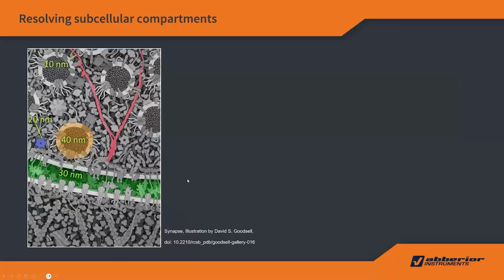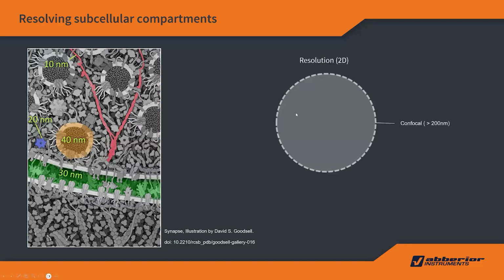As an introduction, I will start with the overview of super resolution, same as 2 days ago. I studied neuroscience, so I use a synapse as an example. These are the structures in the synapse, and the vesicle size, for example, is 40 nanometers. These structures cannot be resolved by confocal microscopy because the XY resolution is around 200 nanometers. Everybody knows the diffraction barrier from light microscopy. With our STED microscopy, the XY resolution comes down to 20 nanometers, and with our MINFLUX microscopy, the resolution is around 2 nanometers, and we can do a lot of interesting research.